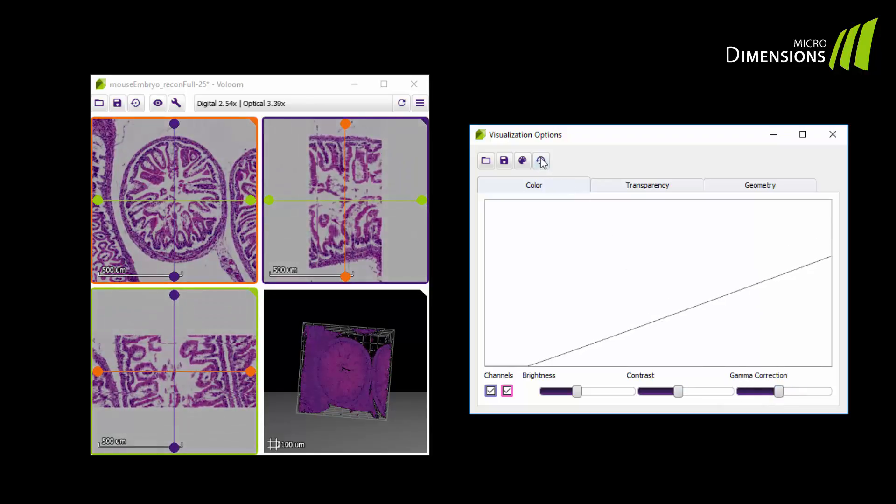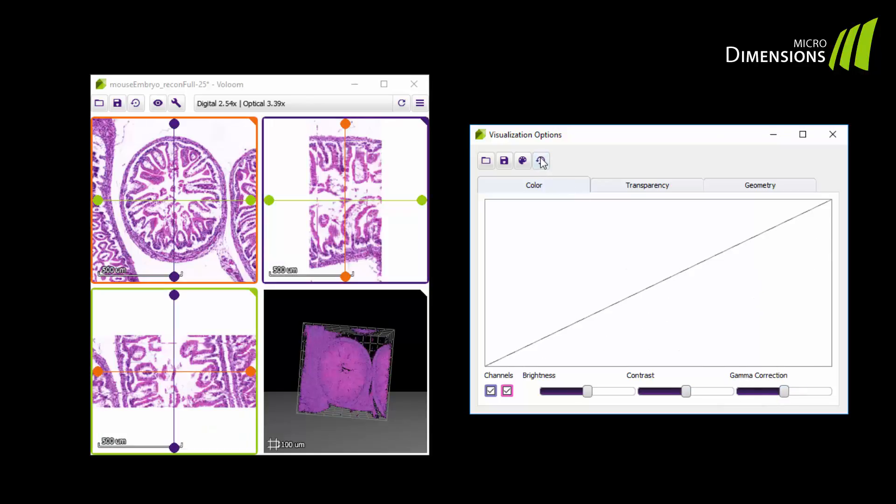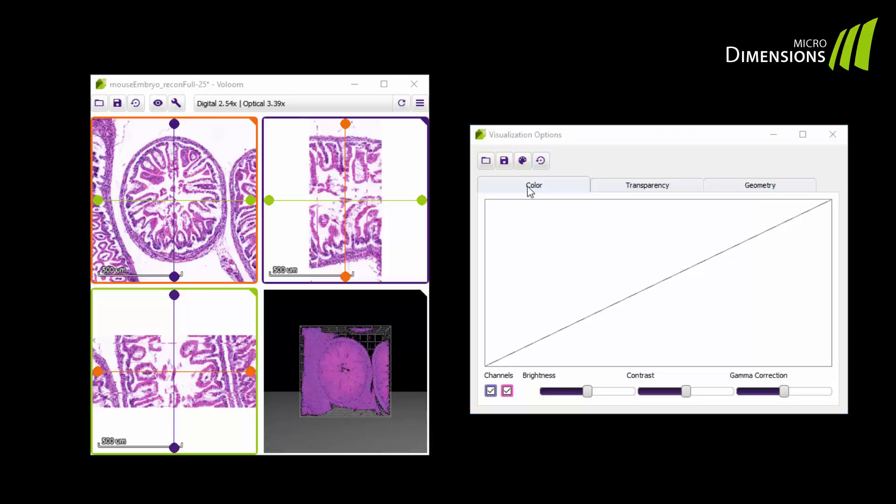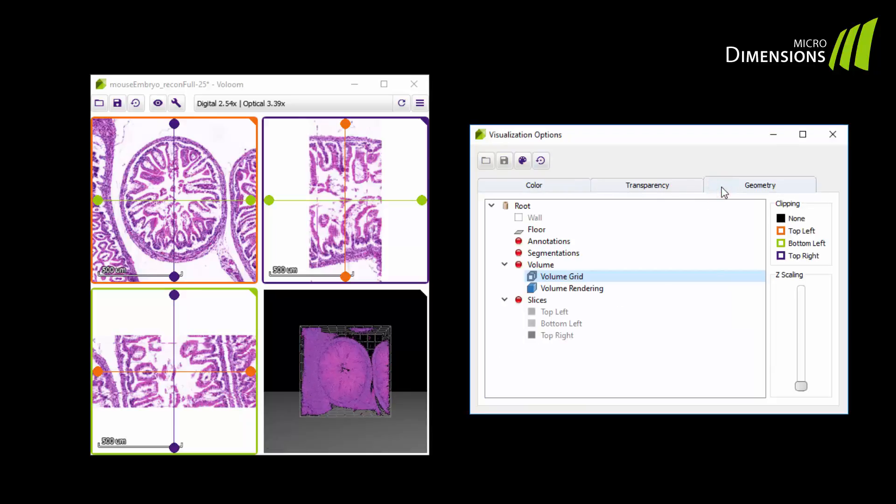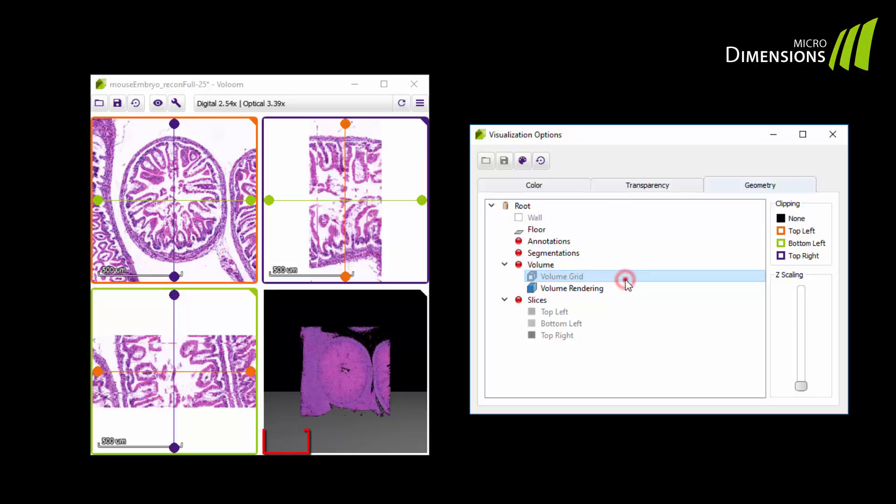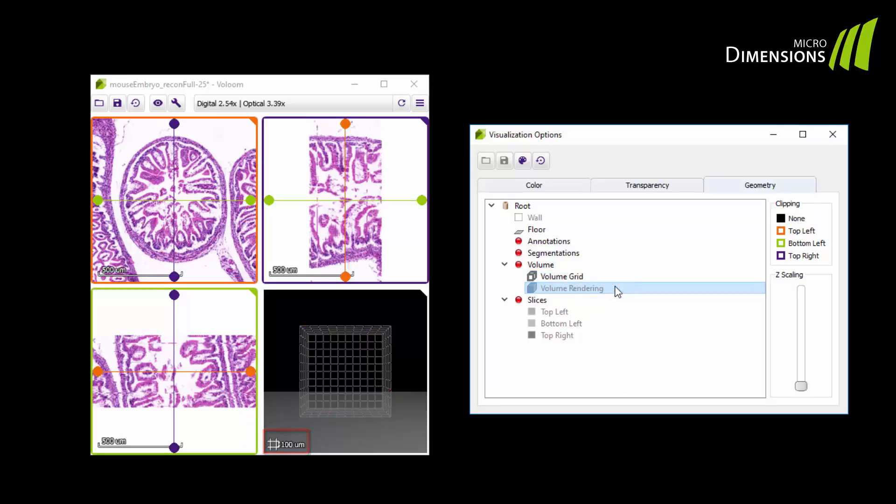Turn your attention once more to the geometry tab. You can turn on and off the volume grid and the volume rendering itself. The spacing is shown in the lower left hand corner of the view when the volume grid is enabled.